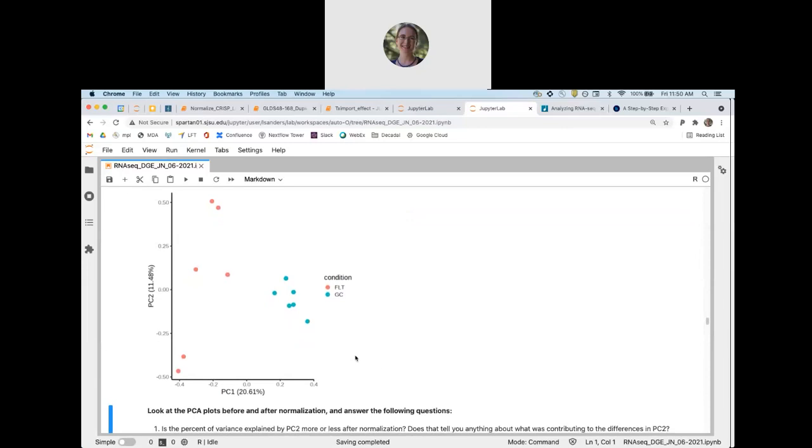So all we've done is we've normalized by sequencing depth.